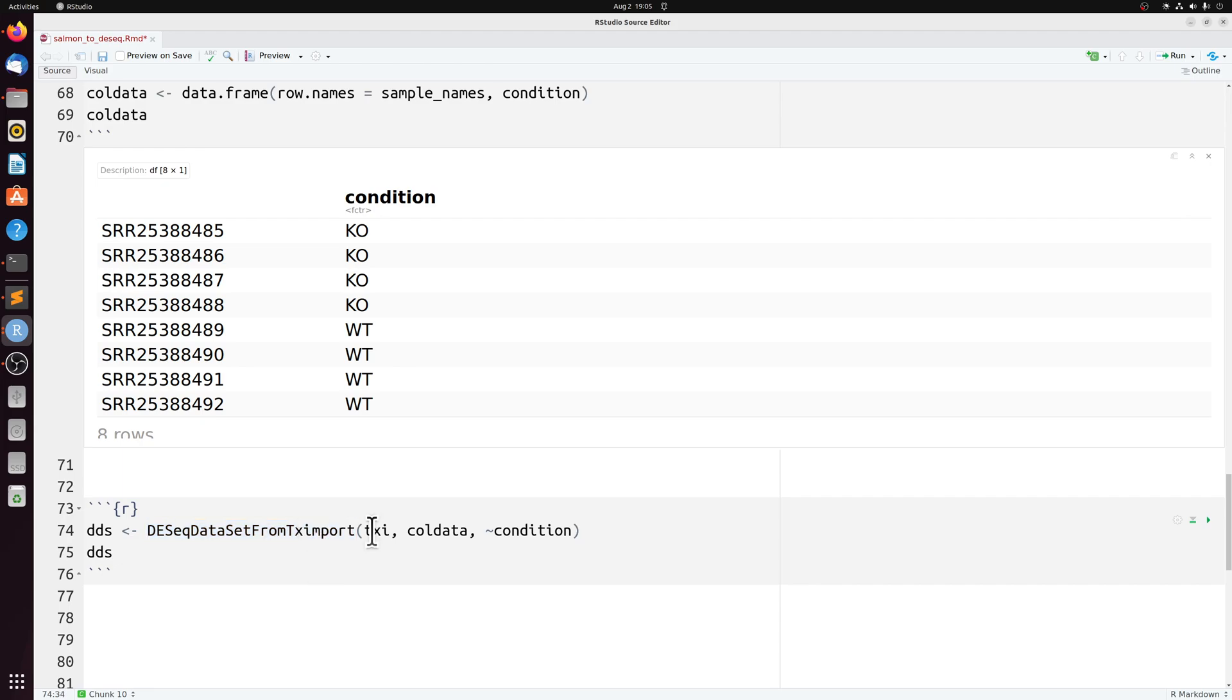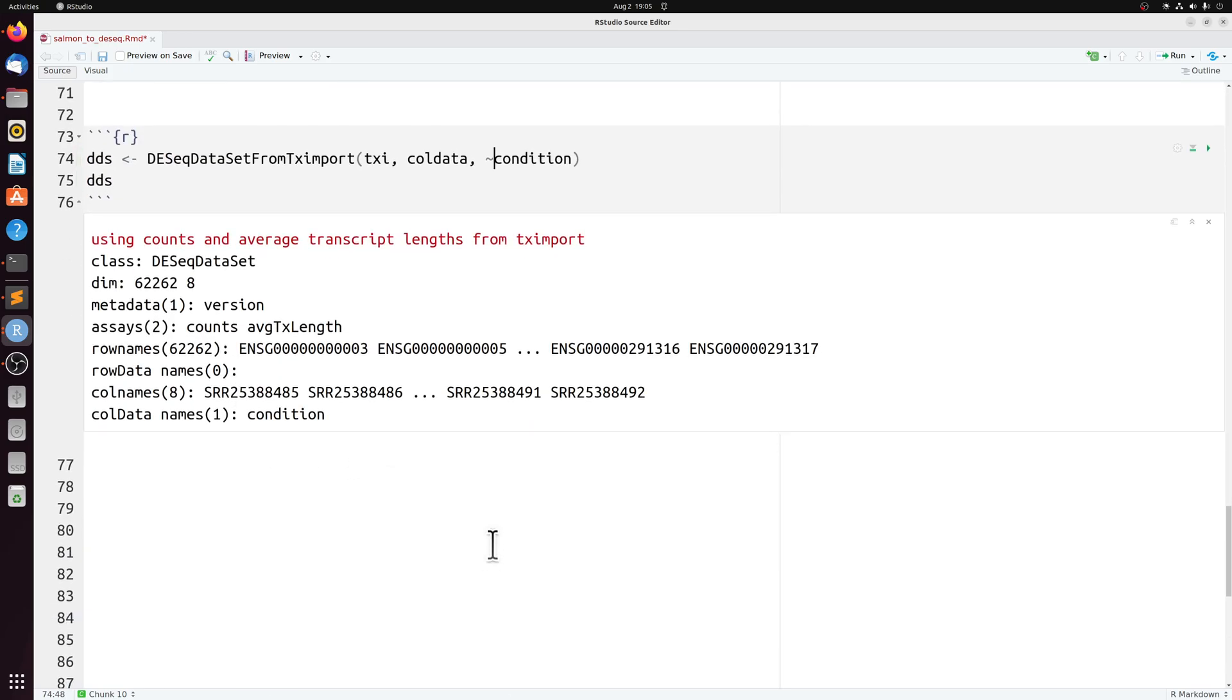And then DESeq has a DESeq data matrix from TXI import. So we just pass our TXI, our column data. And then our formula here is really simple. We just have condition, no batch or anything. And that creates our DESeq object.